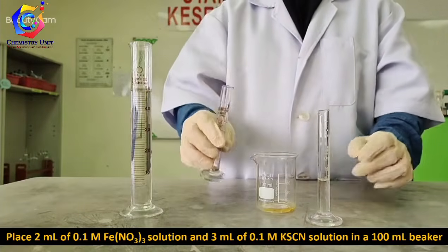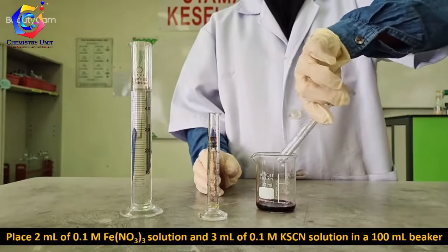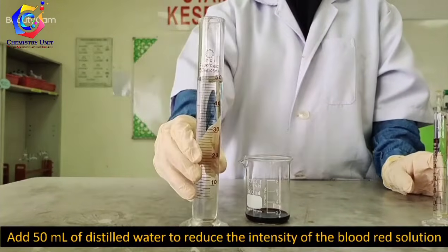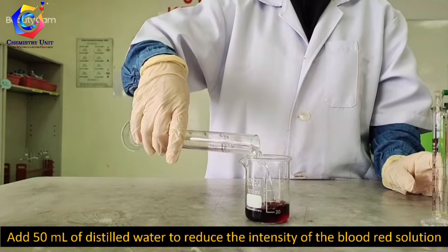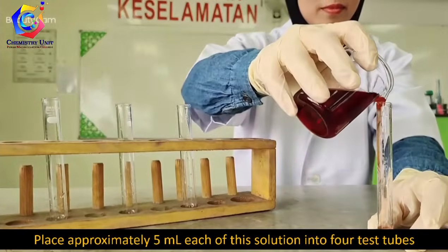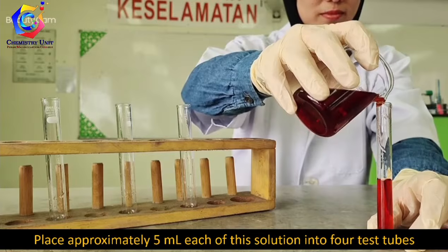Place 2 ml of 0.1 molar iron nitrate solution and 3 ml of 0.1 molar potassium thiocyanate solution in a 100 ml beaker. Add 50 ml of distilled water to reduce the intensity of the blood red solution. Place approximately 5 ml each of this solution into 4 test tubes.